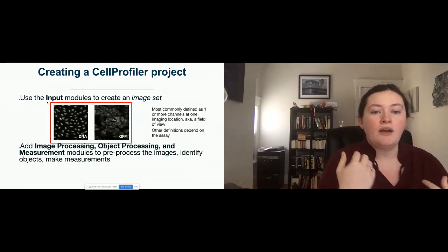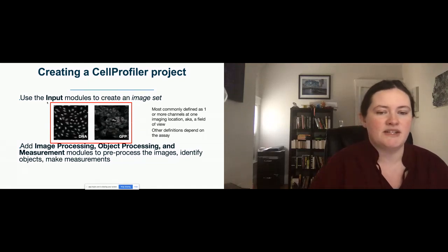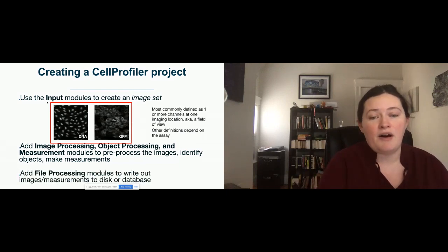You then go through and add different kinds of things to do, such as image, object processing, or measurement, to go through those steps I've outlined a couple times now. And then at the end, to add file processing modules to write out all of your images and measurements to a disk or a database.